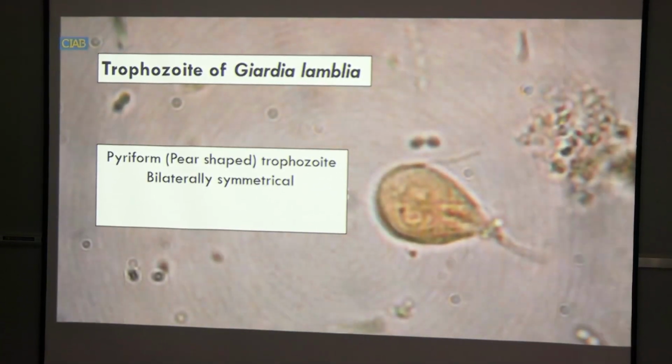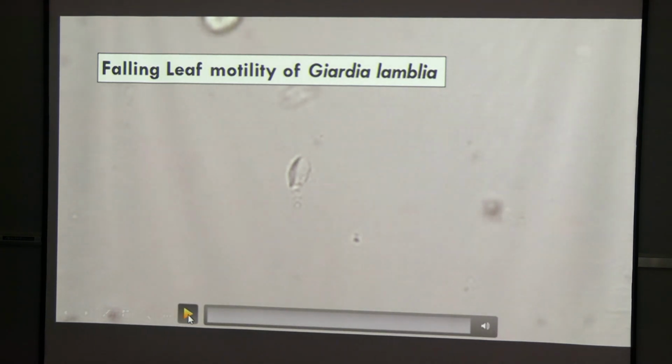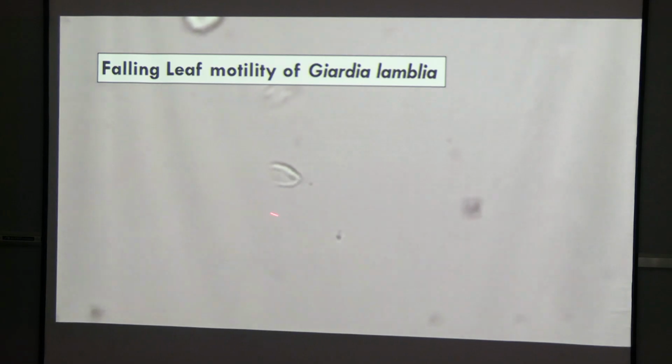Okay, so here we can see the falling leaf motility of Giardia lamblia.